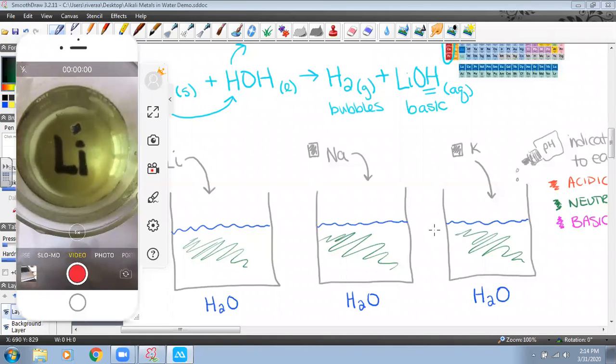It'll take a little minute for that oil to dissipate, right? So the oil and the water don't mix. So maybe if I give it a little stir. You guys should see the bubbling. You might even be able to hear it.